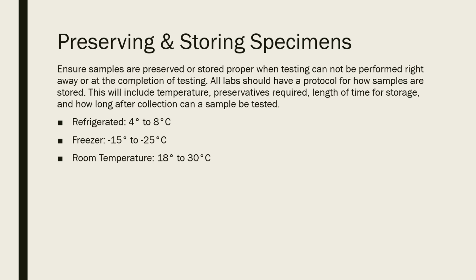The typical refrigerator range is 4 to 8 degrees Celsius. However, you may have a manufacturer that says that this particular kit can only go from a 4 to 6 degrees Celsius range. So you may have to adjust your policy for your lab to be at a 4 to 6 degrees Celsius range versus a 4 to 8 degrees Celsius range.